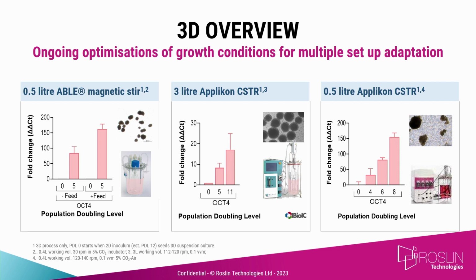What's happening here? I'm still unraveling it, trying to figure it out. Modeling those different reactors, I think, is going to play a key role, and really just challenging and testing the boundaries of the process parameters going forward, particularly the normoxic, hypoxic environment we know is important for stem cell culture. Now, how do we translate that into process?